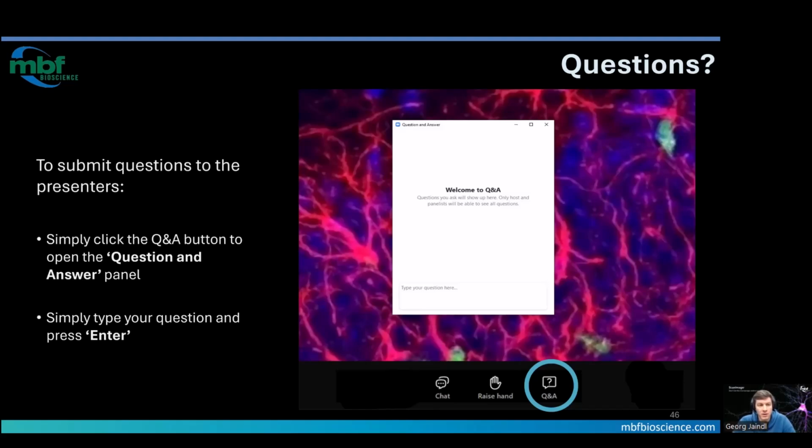So if you access components in ScanImage like the photostim module or the scan2d objects, all of that is the same. What has changed is the interactions with the user interface, right? So if you try to access the user interface directly over HSI controller, for instance, that has changed and that would need to update.